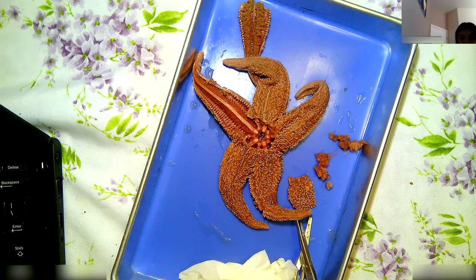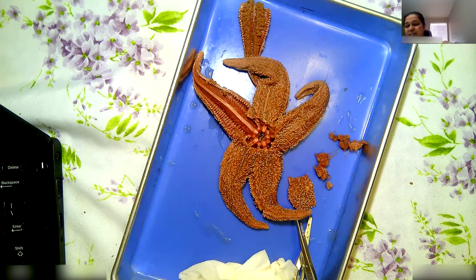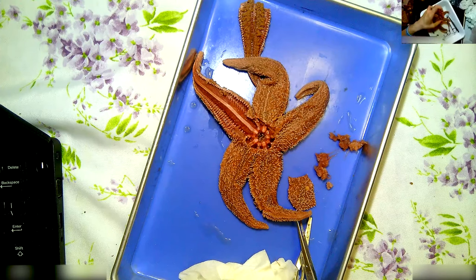Miss, I have a question. Sure. When I was opening the bag with the starfish in it, were my eyes supposed to burn? Your eyes are burning? Yes. That's why we asked you to rinse it. Just leave it and go rinse your eyes — nothing to worry, just splash some water onto your eyes. That's why we asked you to rinse it — it's a little strong. They kept it in a strong solution to preserve it so it wouldn't dry out. Sorry, guys — it's part of the science.